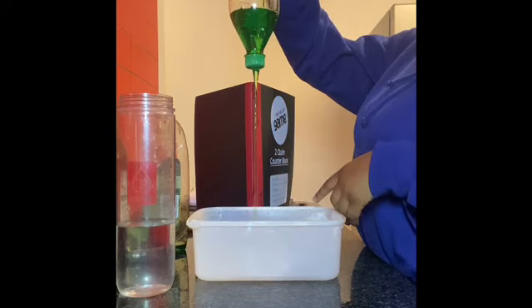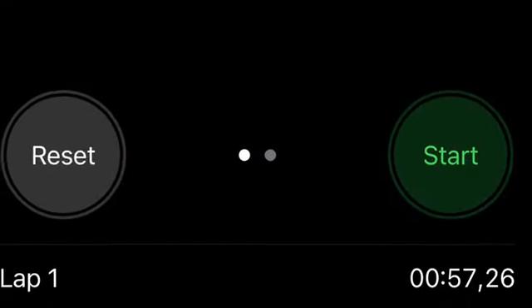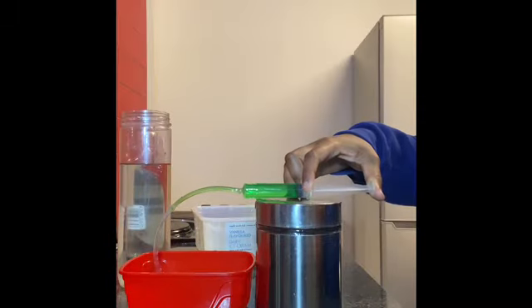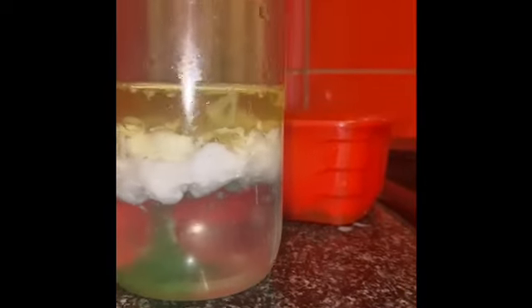The experiment was also able to present the relationship between temperature, viscosity, and density efficiently, as the results obtained indicate that a drop in temperature results in an increase in density. In addition, a floating test was used to support the results obtained from the experiment. As you can see, the densest liquid is at the bottom.